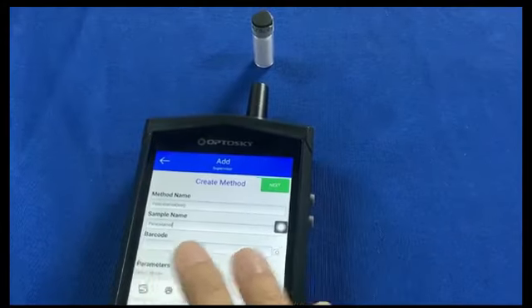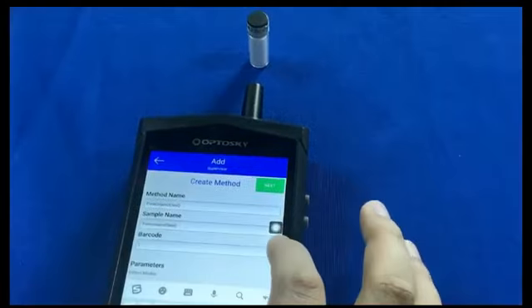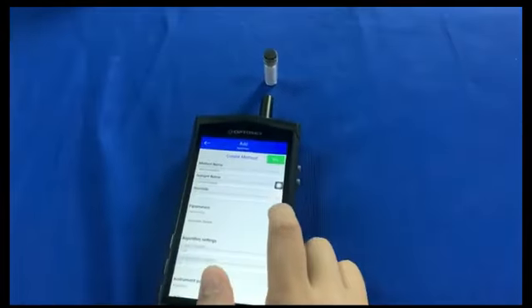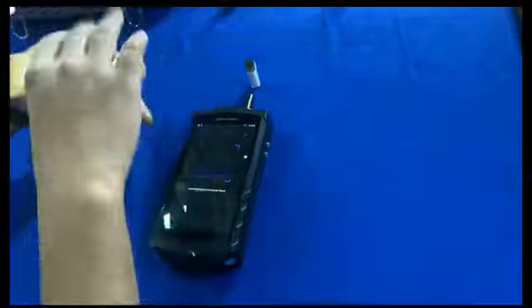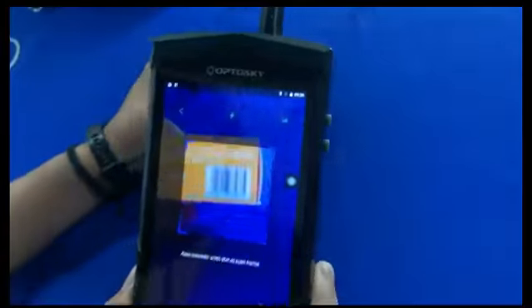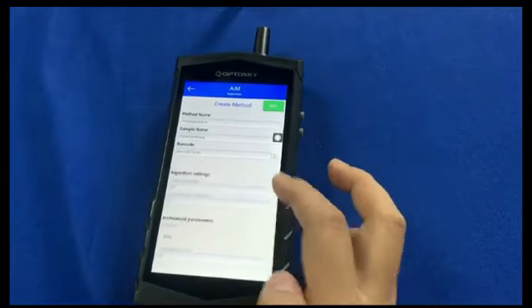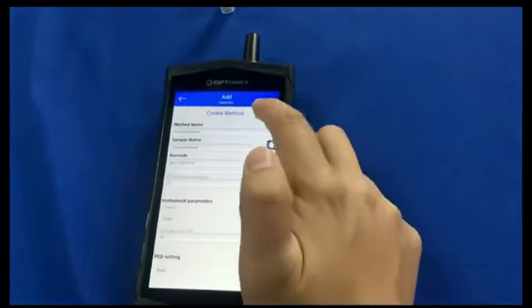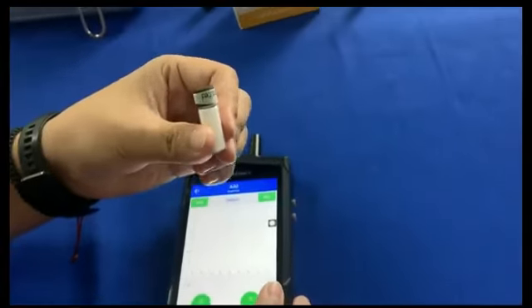The new method paracetamol has been successfully set up, and then we need to use the paracetamol to generate a new method. You can use the liquid sample cell. Press the button and detect. You need to perform 20 scans to create a method.